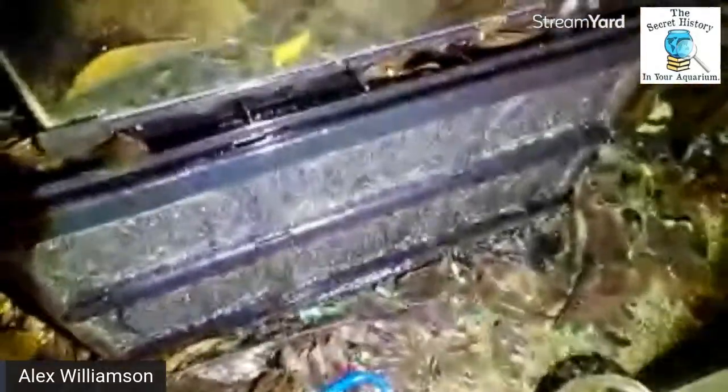Then we've got, sorry guys, I'm flipping around. Then we've got bucket of stuff, which still has snails in it. Still has snails. There we go. This should be better. But I think this is planaria right here. Or not planaria, but paramecium. See that cloud that's in there? I think that's paramecium. And I think just getting a few samples of this and kicking up the moss a little bit, we'll get some interesting stuff to look at there.